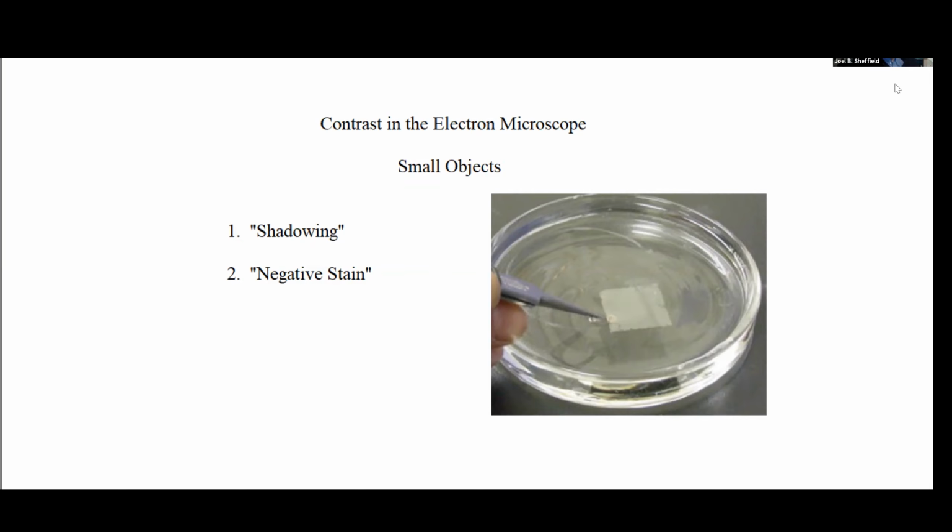But what I meant was the idea that you could look at large objects and make them small by cutting them up or taking smaller slices or doing something like that. We're going to talk about that part of it next time. But there's a whole world of really small objects that were visible only when the electron microscope became available.